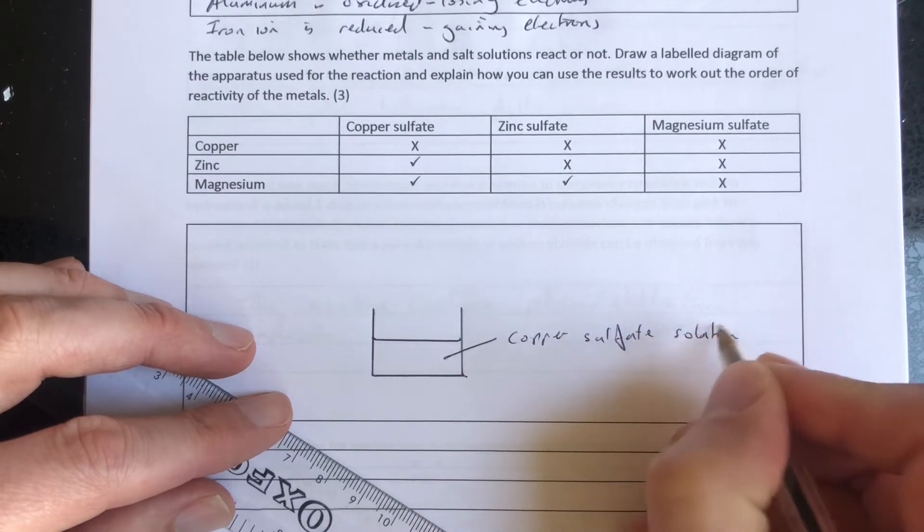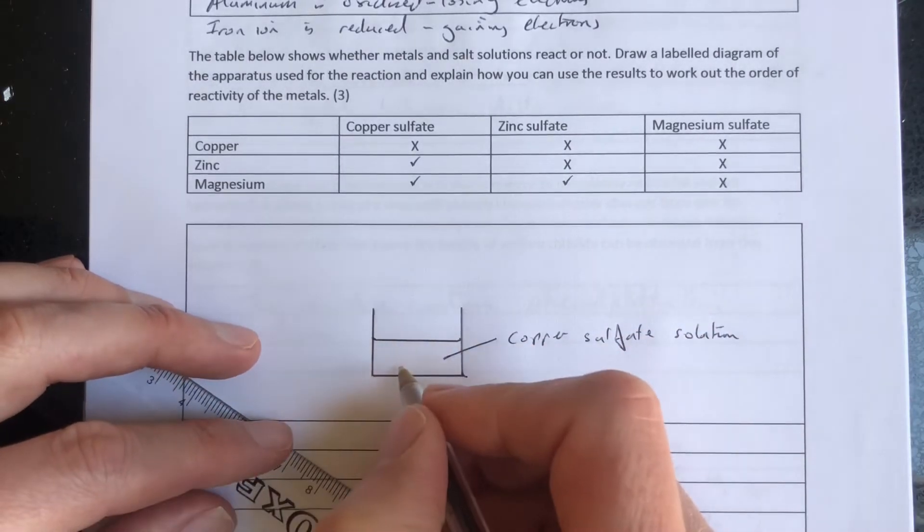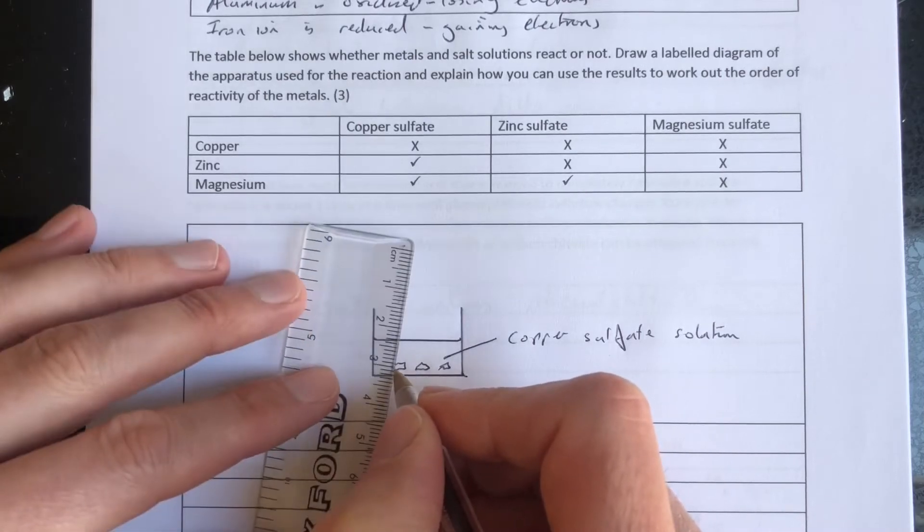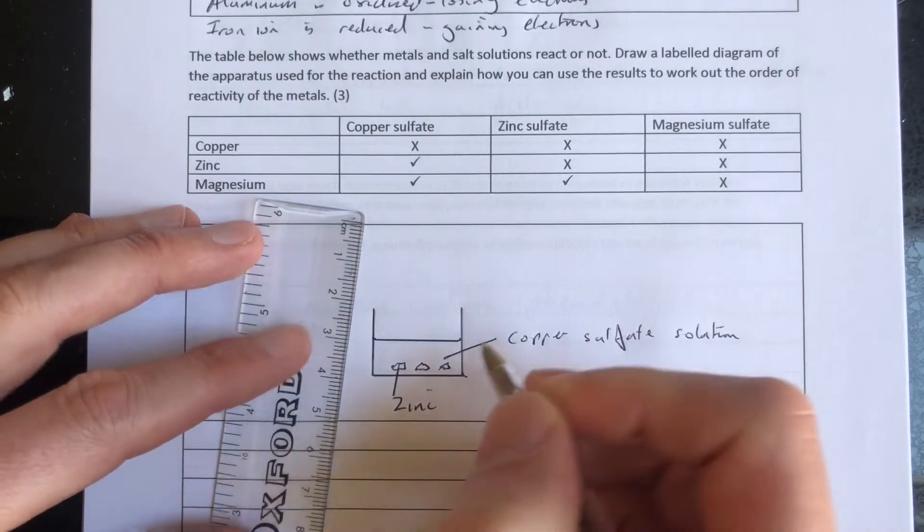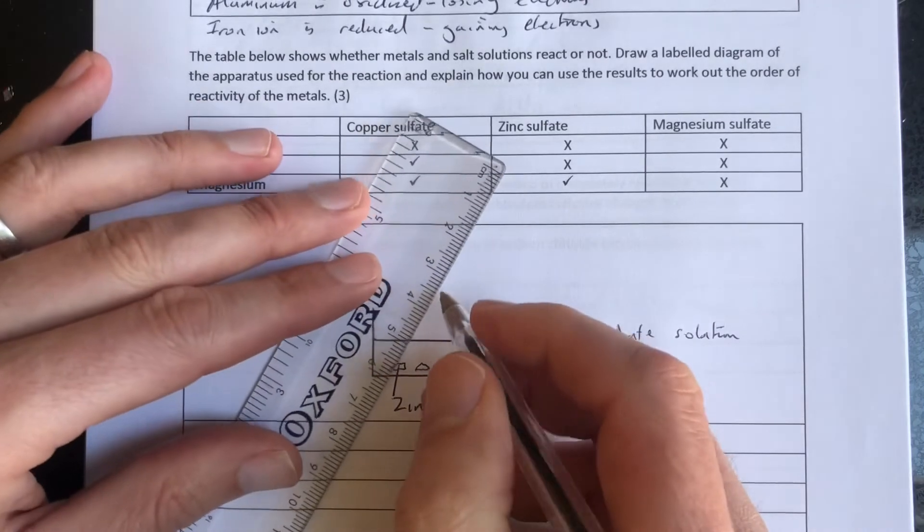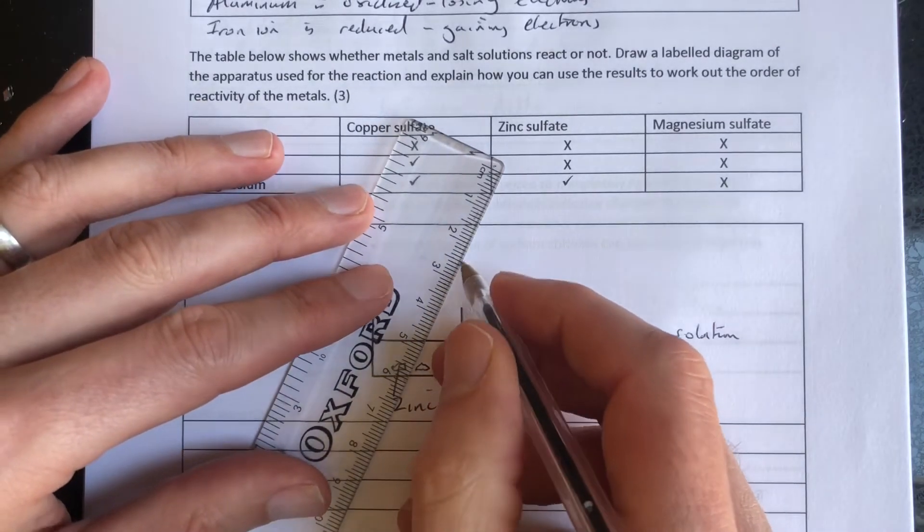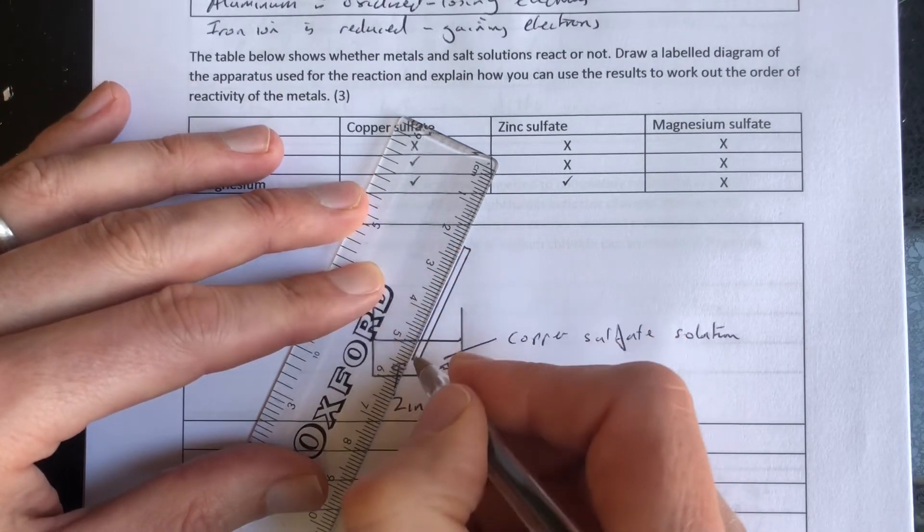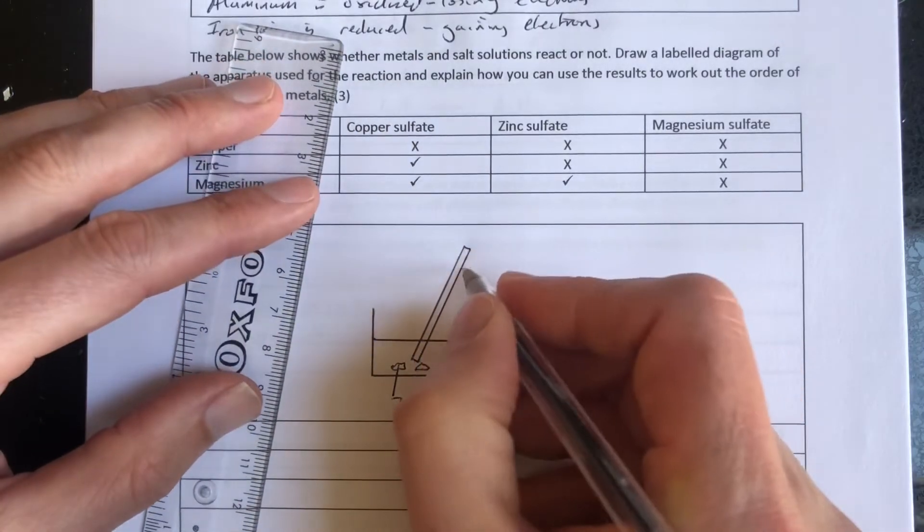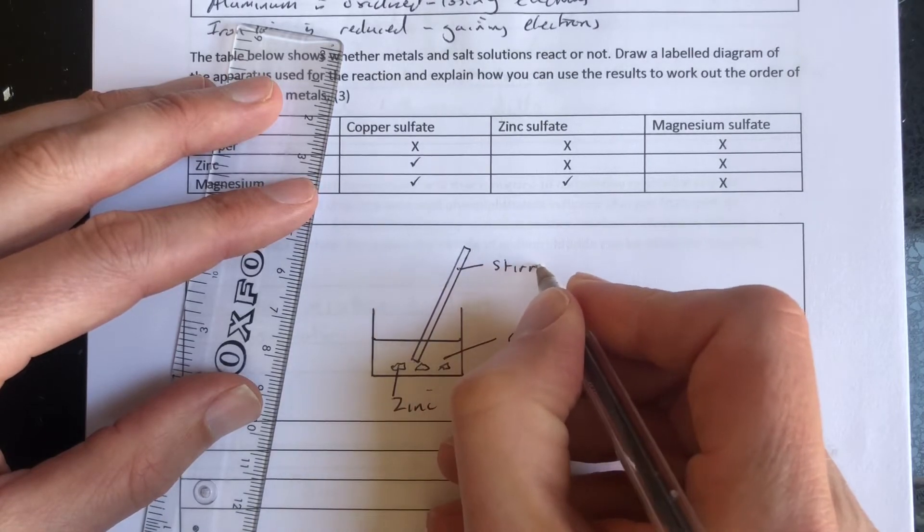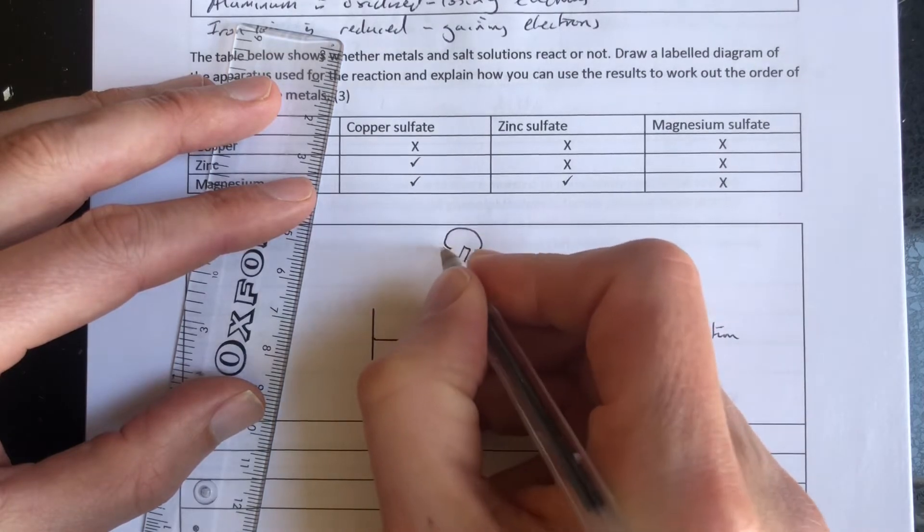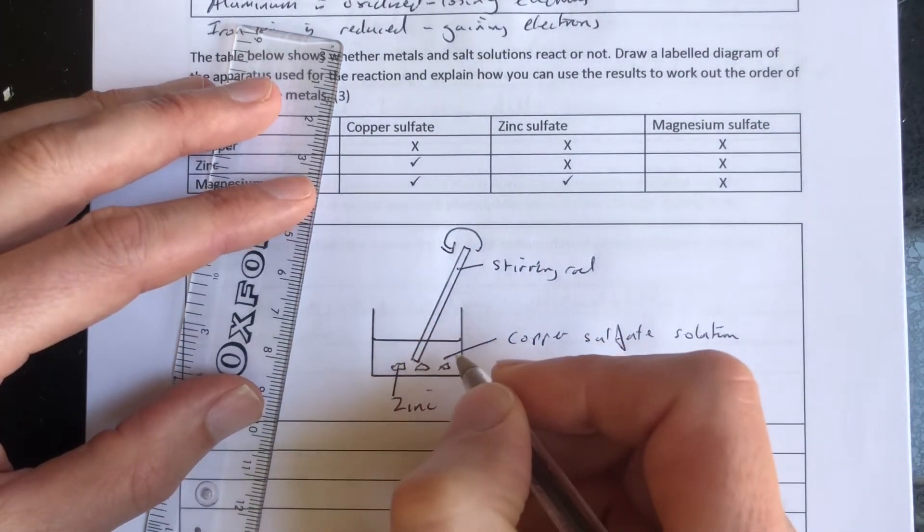And then we're going to put the metal in there. So we have some zinc granules at the bottom here. This is the metal here, the zinc. So we're taking a metal and reacting it with a different metal salt solution. And we're going to need to stir that. So this is going to be our stirring rod.